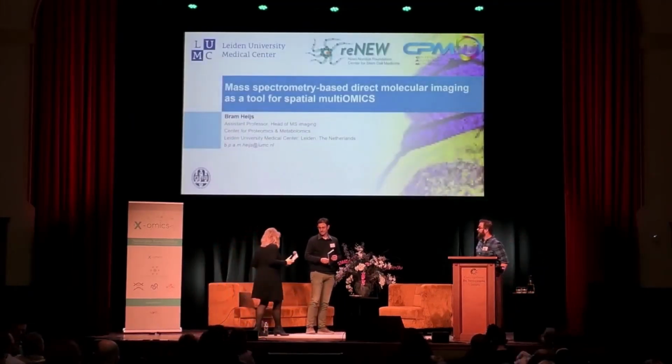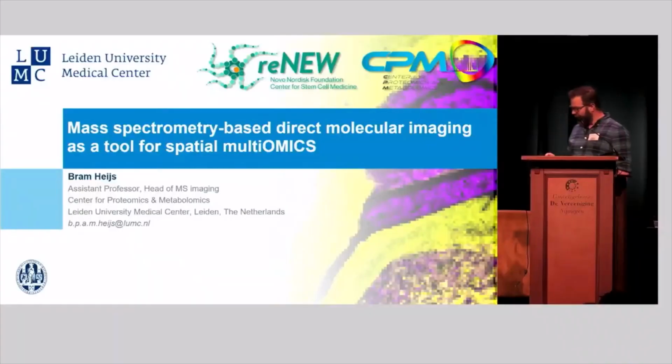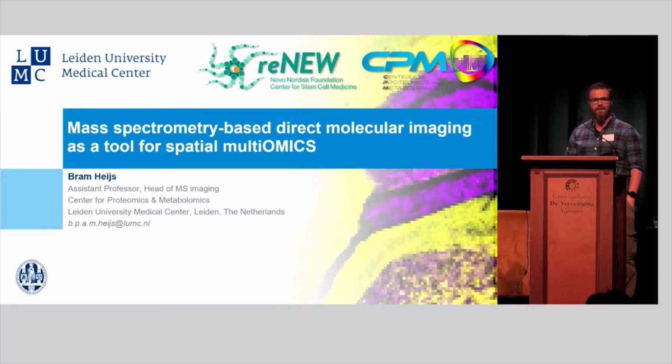Yeah, thank you for the introduction, Guinevere. Slightly misleading title here. I made a mistake, I hope that will be the only one for today. So indeed, mass spectrometry imaging, the title is true though. We can use mass spectrometry imaging as a tool for multi-omics in the spatial nature. But today I want to talk about dynamic metabolism. So we're adding a different dimension to 2D data, which is time.